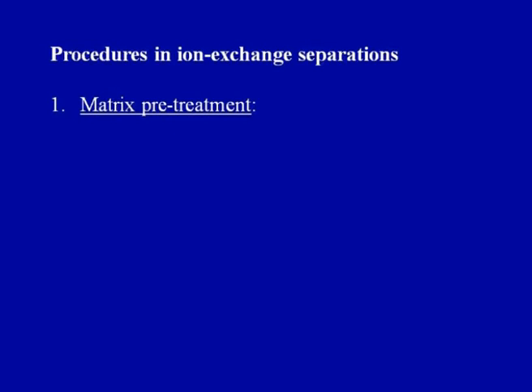All right. So, these were all the different factors we have discussed regarding what you have to take care of when you are attempting to do ion exchange chromatography, and accordingly you have to design your ion exchange chromatography experiment. Now, if we see the simple procedure as I was explaining earlier in a very simple way, the procedure in ion exchange separation is quite straightforward.